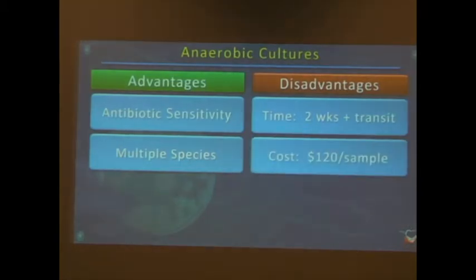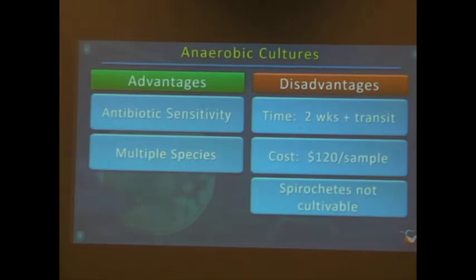And in the summer, of course, you have to send them overnight because they're temperature sensitive. And the last time I checked, cost about $120 per sample. They cannot cultivate spirochetes. Nobody knows how to make spirochetes grow well in culture yet. But they use backup for that. At the Temple University, they use one of our microscopes to check for spirochetes in the samples.